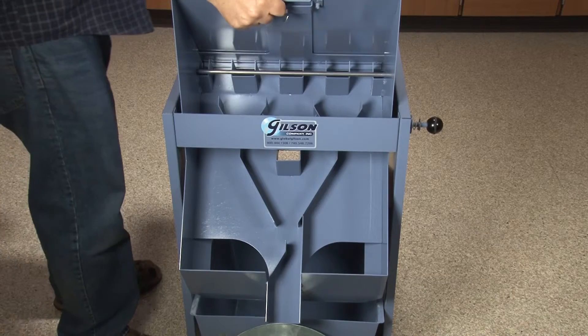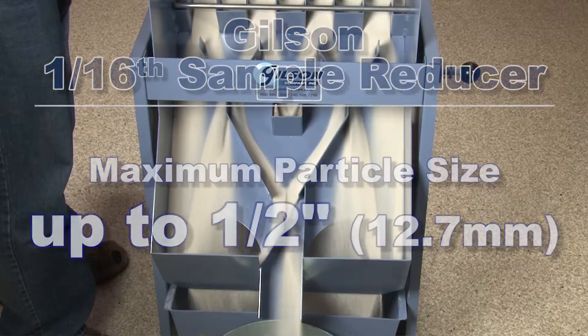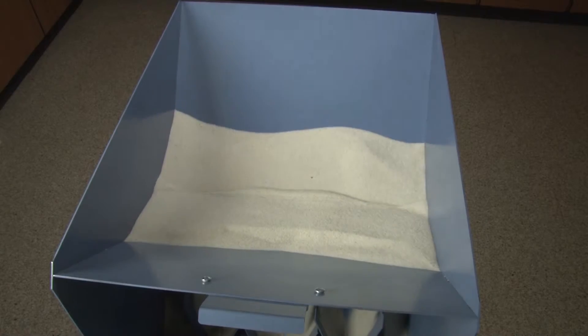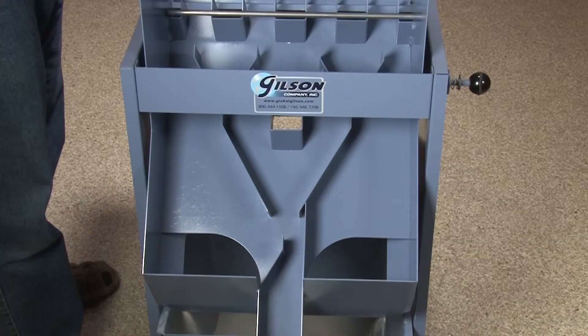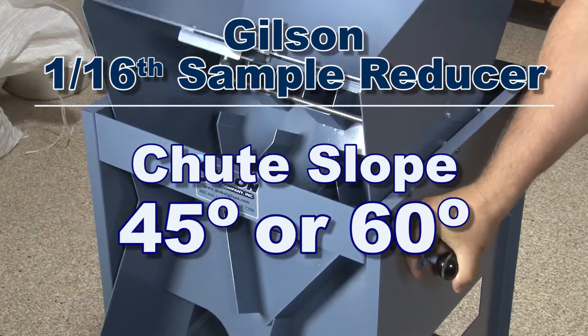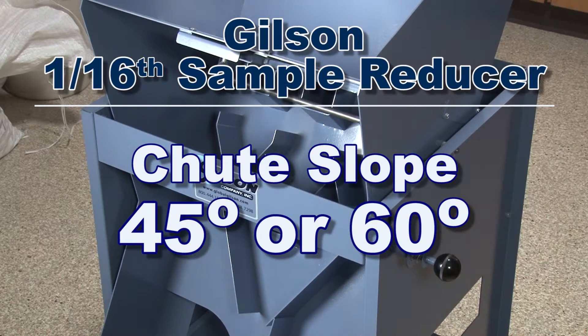Designed for any free-flowing granular material up to one-half inch, the SP52 is especially useful in sample preparation and dividing of proppant materials for hydraulic fracturing operations. The GILSON sample reducer can be set at either 45 degrees or 60 degrees dividing position to match your unique material characteristics.